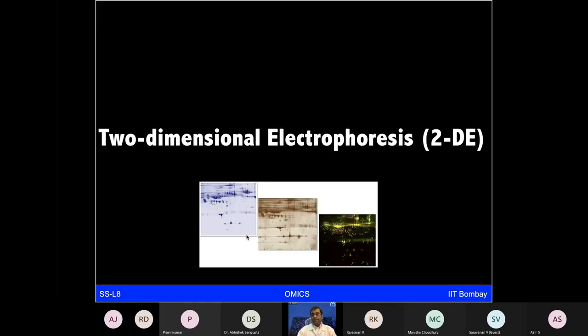So these are the basics of SDS-PAGE, which is commonly used to make sure of what protein you have purified or extracted, what the quality of that is, and what the molecular weight size of that protein is. But for looking at more complex disease biology or actual biological problems of interest, you want to separate really complex mixtures of proteins. SDS-PAGE is only going to give you separation based on one property, which is their molecular weight.